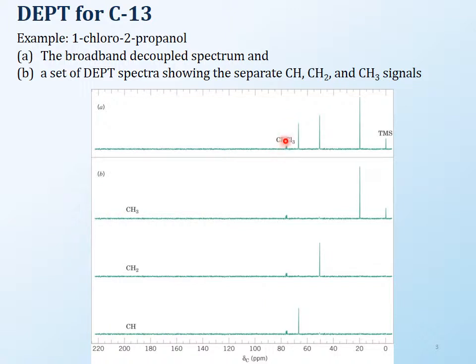This little peak that you see here is for CDCl3. You have never seen the solvent peak before. The only peak you have seen before is the TMS peak, and we put the TMS in there because we want the 0 mark. You've never seen the CDCl3 peak before because the sample overwhelmed the solvent. But now that we're talking about carbons, this carbon is also capable of being a C-13, and so that's why you end up seeing a little bit of the solvent peak here. You will see that around 77 or 78 ppm.